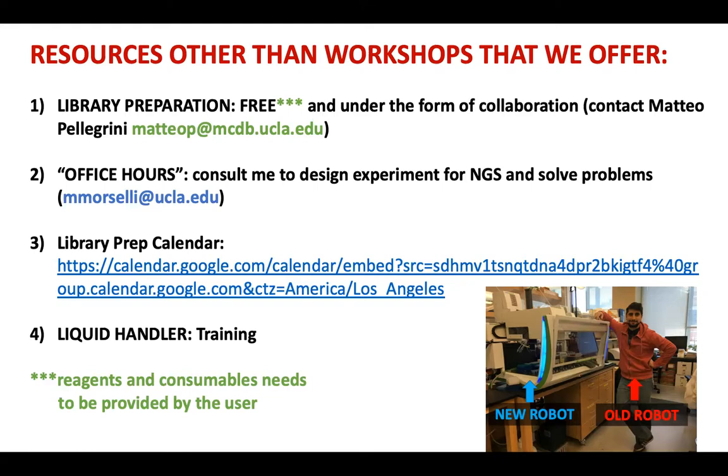I have to give you training on how to use the liquid handler. And if you want to, we have some applications that are already scripted in the machine. For example, RNA-seq, which is very popular, or some basic DNA sequencing methods. So if you want to use the machine because you have tons of samples and you want to waste your life over library preparation, just talk to me, and then we can program your protocol on the liquid handler, and then you can perform the library preparation using the robot, okay?